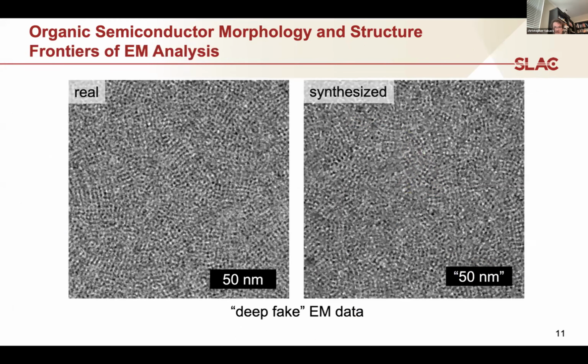So with the future of this, if we understand all of the correlations in our data, it actually turns out you can create synthetic data that utilizes and represents these correlations. You could call this, for example, deep faking of morphology, utilizing higher order correlations across space and angle. So this is something to keep in mind for the future. That's somewhat horrifying, but it's also really exciting that we can start to capture these things in finite coefficients.